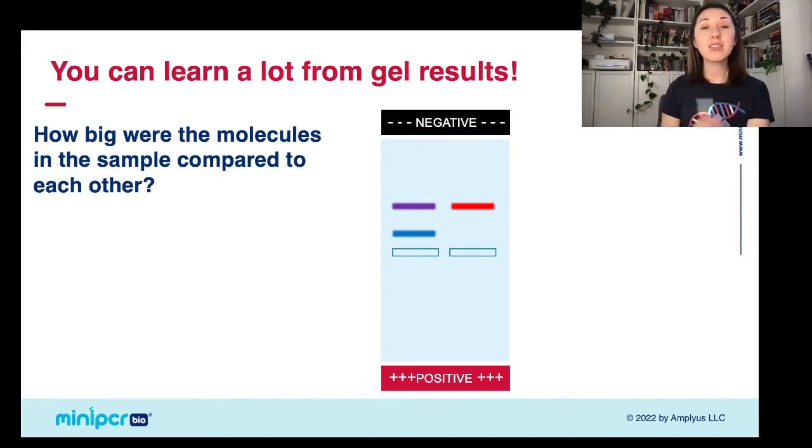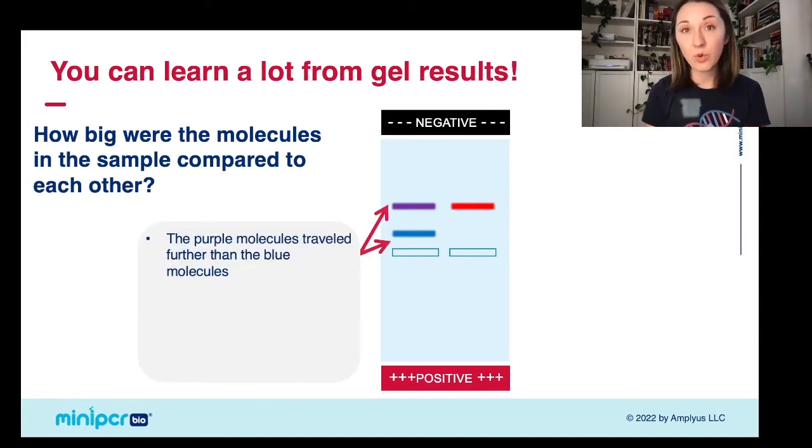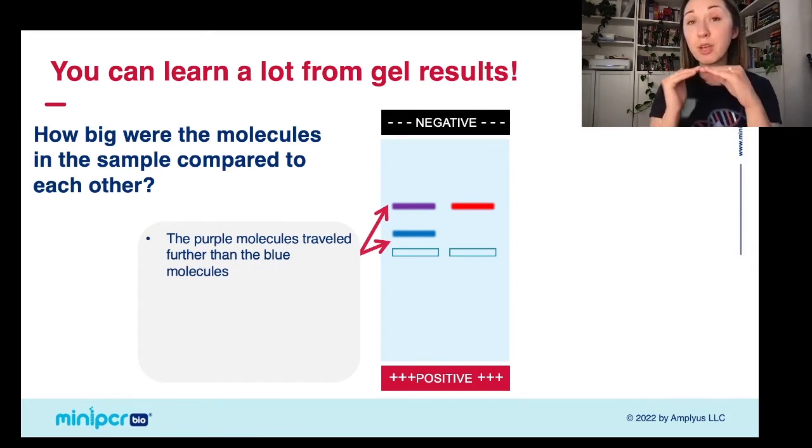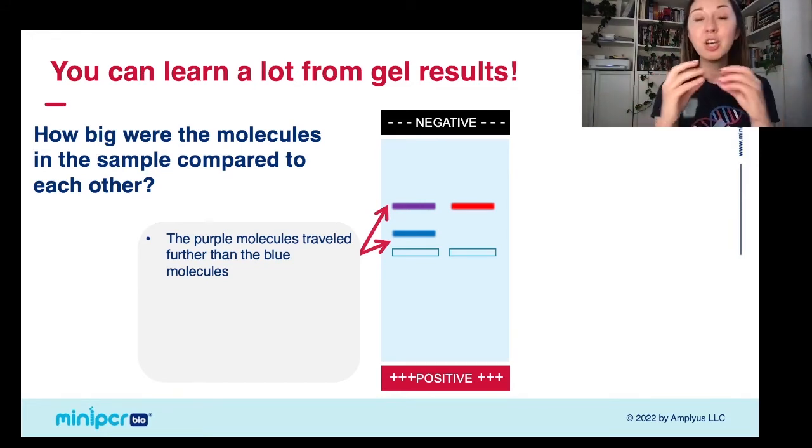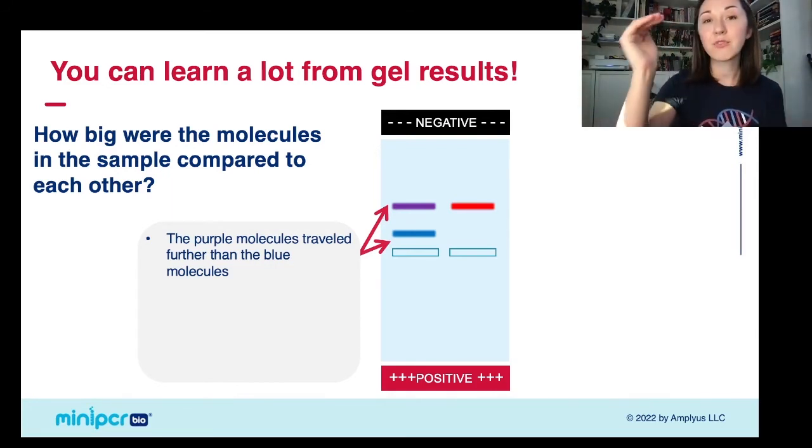So here on the left, in our left lane, we have two bands. So the purple molecules traveled farther through the gel than the blue molecules. And again, remember that we are measuring from the well. If you're used to doing DNA electrophoresis, you might be thinking of measuring from the top to the bottom. But here, we loaded those in the middle of the gel so that we could tell which charge they had, if they were positively or negatively charged. So we're measuring distance from the well.